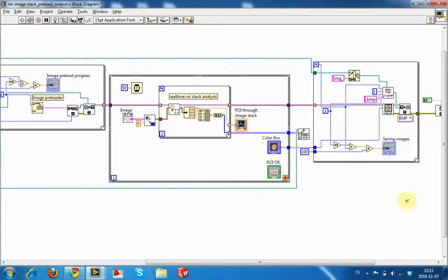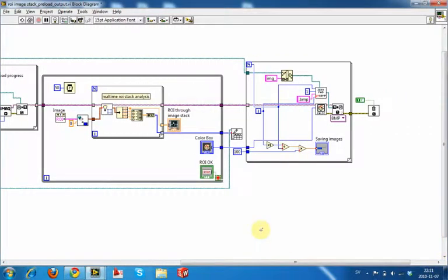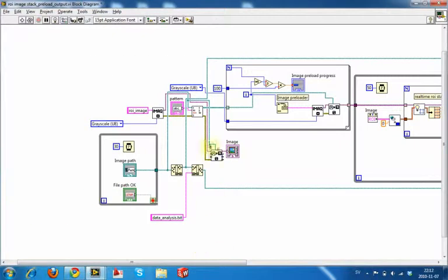We also have this little extra section here, which I thought would be fun. It introduces a couple of ideas that I brought up. One is zero padding file names. That's important when we start looking at large numbers of files and making sure they stay in the correct order. It's a good idea to make sure that we zero pad the file names, so that we don't have to constantly do the ordering of the files. If they're all handled in a zero padded manner, we wouldn't essentially need this ordering scheme.